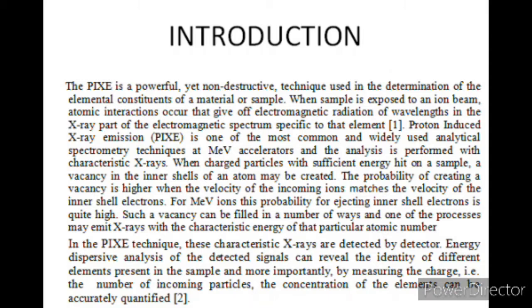Introduction. PIXE is a powerful yet non-destructive technique used in the determination of element constituents of a material sample. When a sample is exposed to an ion beam, atomic interaction occurs that gives off electromagnetic radiation of wavelengths in the X-ray part of the electromagnetic spectrum specific to that element. Proton-induced X-ray emission is one of the most common and widely used analytical spectrometry techniques at MeV accelerators, and the analysis is performed with the characteristic X-ray.